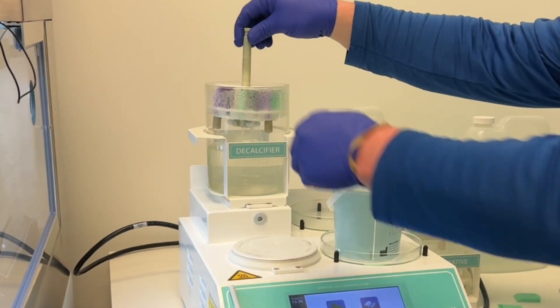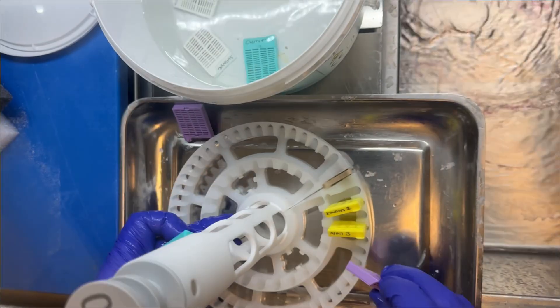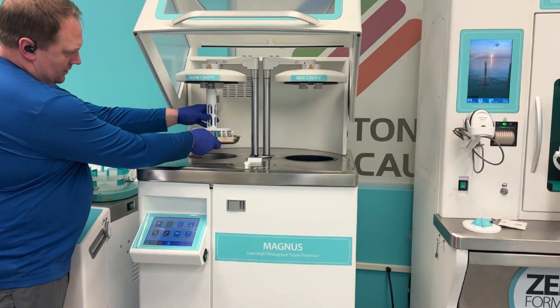Five hours later, we removed the cassette from the bone station, rinsed it for a few minutes, then added it to the rack with the rest of the nail specimens. Next, all the specimens were processed using a xylene-free protocol on our Magnus tissue processor.